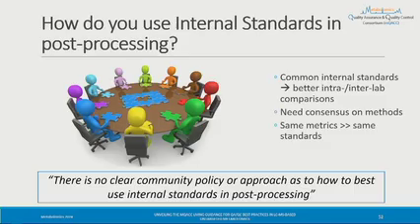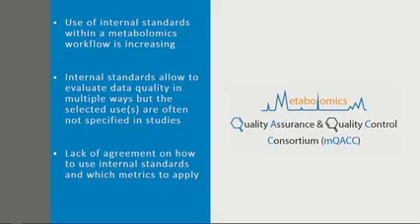However, because we're using a plethora of different analytical methods, it may not be possible to have exactly the same internal standards for everyone. So at the moment, we are focusing more on metrics. I think if we can harmonize metrics and how we are using internal standards, that's the first step before actually harmonizing which internal standards we are using. So I think as a community, we have some work to do on that part.